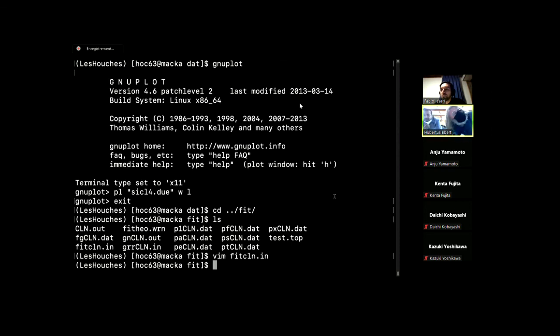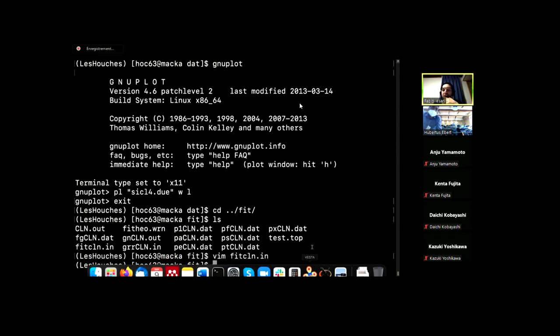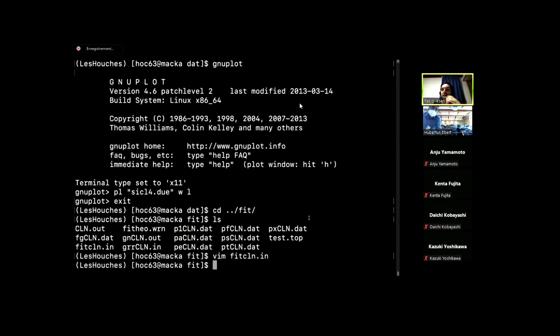Just one question. Which program did you mean? Kreml. Okay. Otherwise, just a comment, Salim, there is the Babel program that you can download, and that basically converts any structural file into any other structural file. Yeah, I think there are many programs that do this. I usually use Vesta. What you do is you read the CIF file, and then you just export the fractional coordinates of your unit cell.